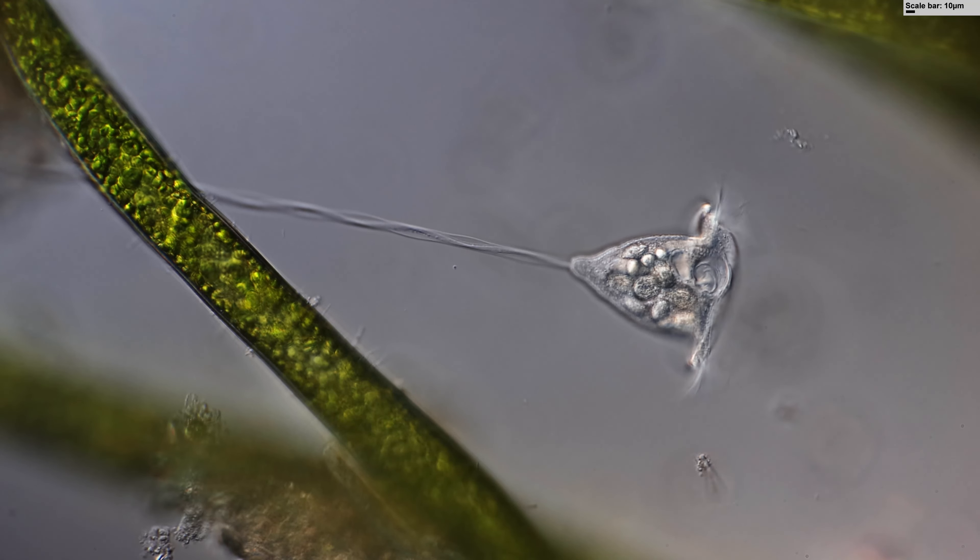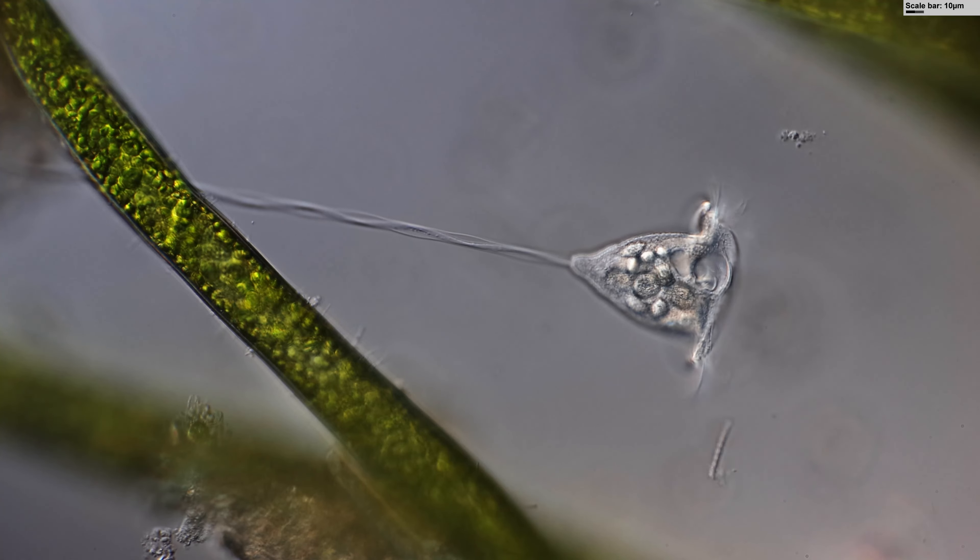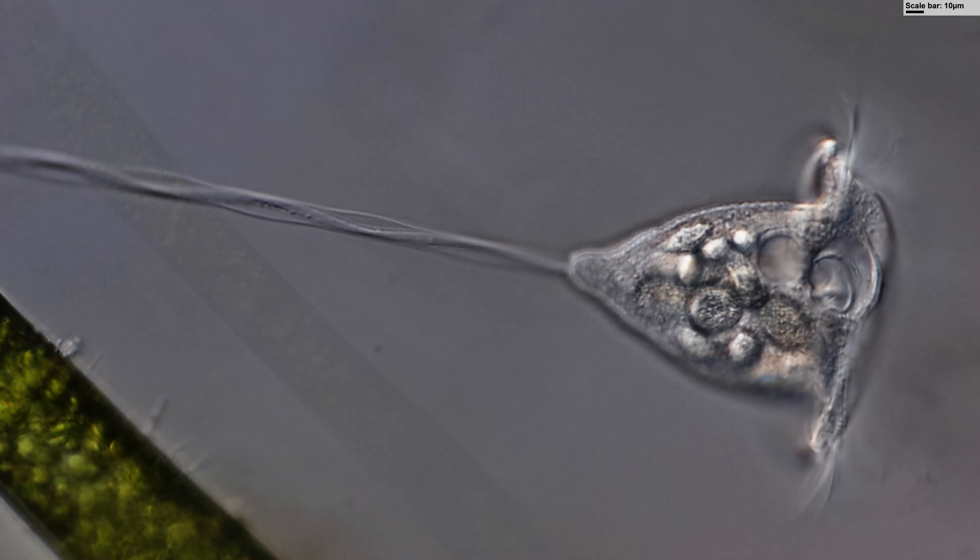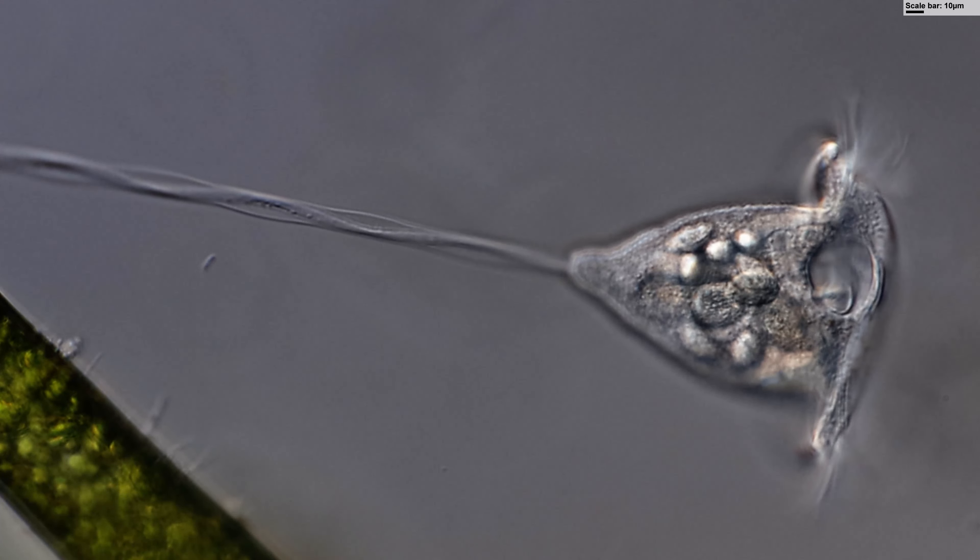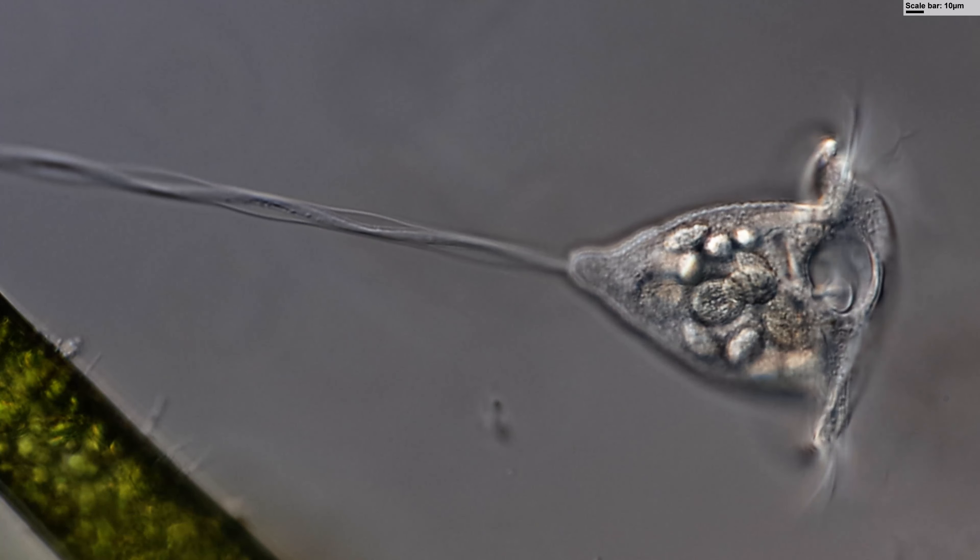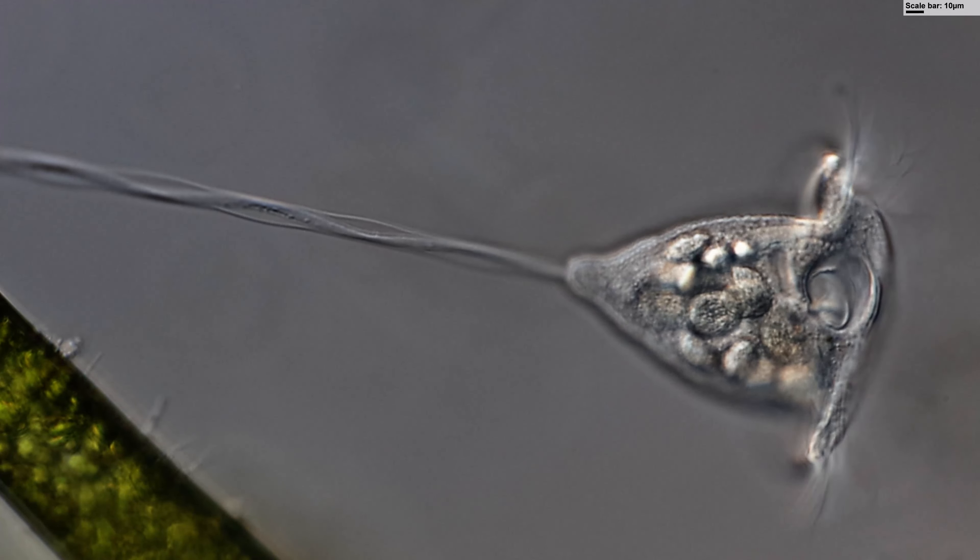Those algae are a good place for vorticella to attach to, and this is one of those nice beautiful specimens that are found. Being a heterotroph, those vorticella of course consume a large amount of oxygen as well—oxygen that the algae and other water plants provide.